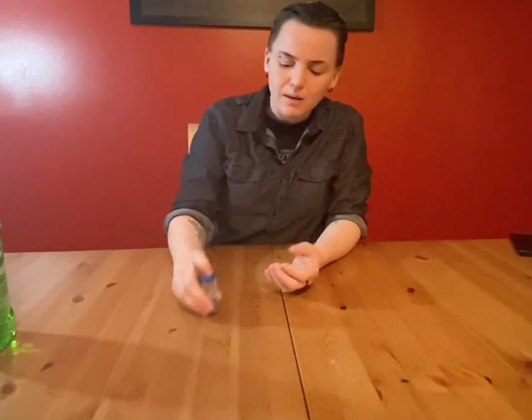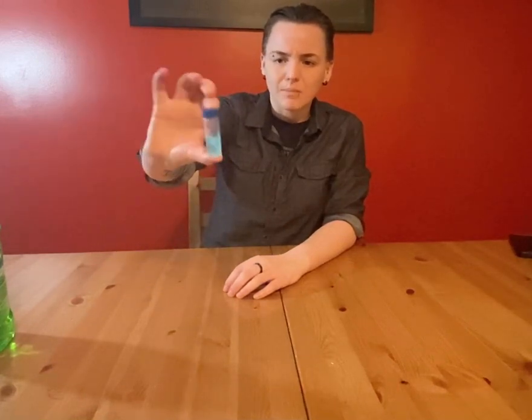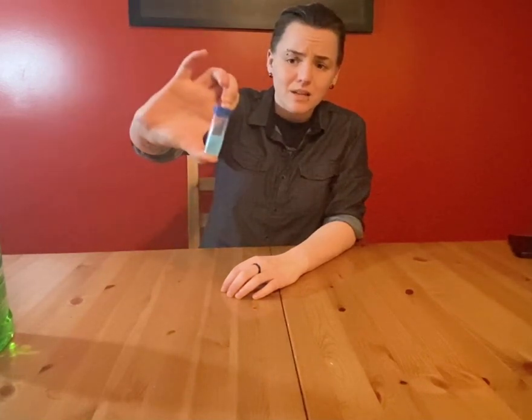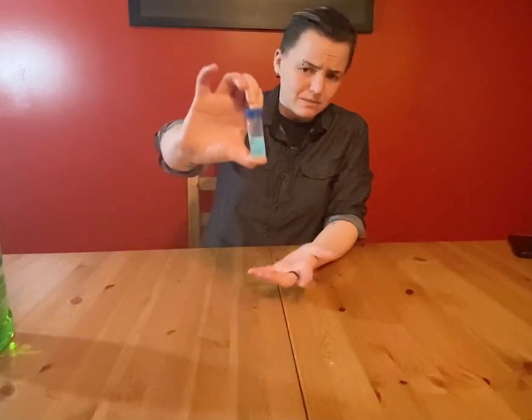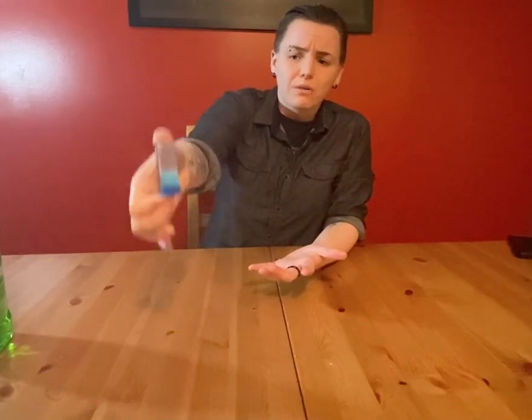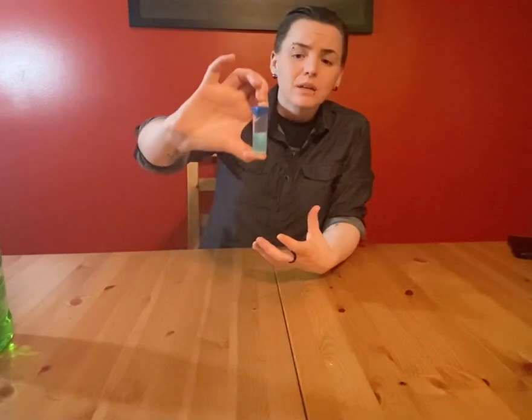So what you're going to do is take this and invert it a couple of times. You don't want to shake it to the point that you end up with bubbles, but you want to just tip it up and down, like what I'm doing right now. And this is going to dissolve the cell membrane and the membrane of the nucleus, and release the DNA from the cells.